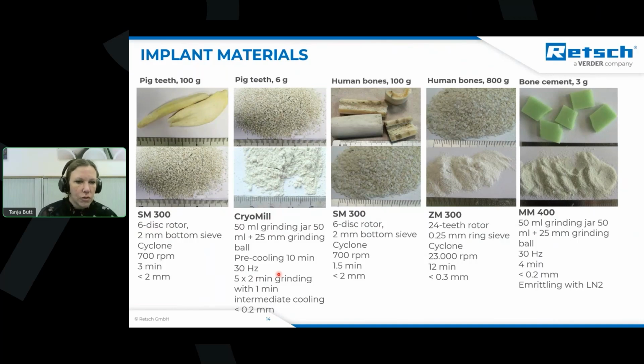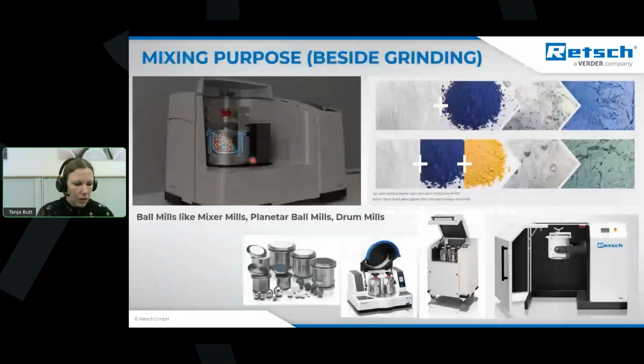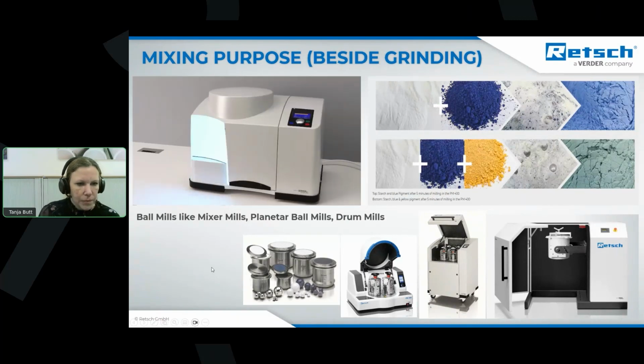And then we can also pulverize such sample materials. Okay, coming away from just this grinding purposes, I think that also mixing purposes are very important in pharmaceutical applications. And here I'd like to quickly show the working principle of the planetary ball mill system.